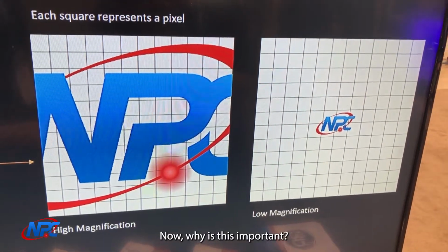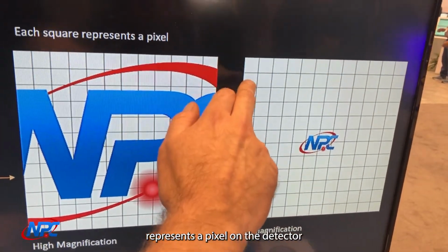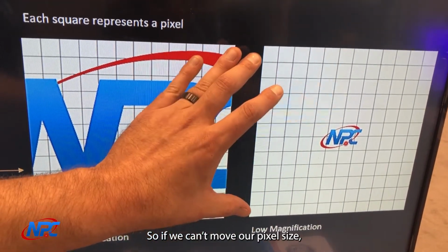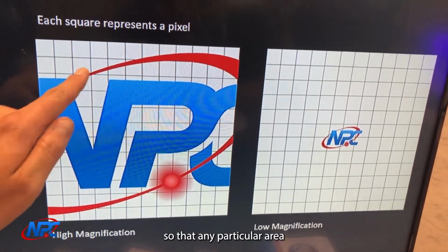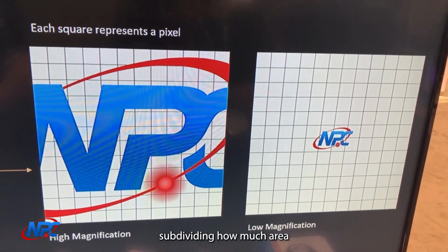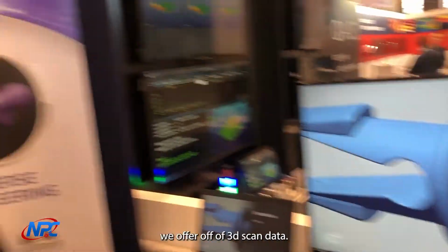Now, why is this important? Each one of these little boxes here represents a pixel on the detector, and our pixel size is fixed. So if we can't change our pixel size, what we can do is stretch our image over more pixels so that any particular area is being described by more and more pixels, subdividing how much area of that curve you can describe.